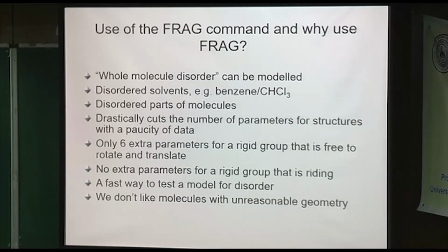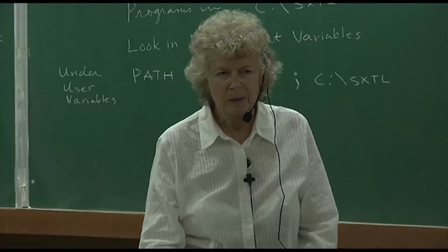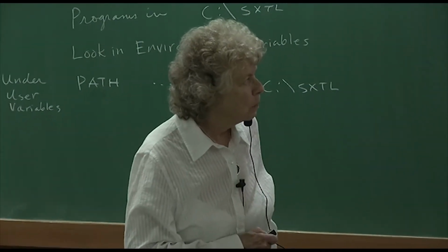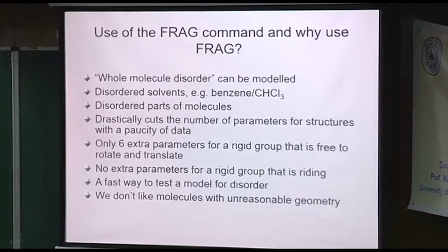Okay, now I'm going to talk about FRAG. This is pretty advanced stuff, and bear with me because it's extremely powerful. And maybe the first time you try this, you won't get it right, but you can always ask me, and I can help you. One of the ways you use it is this whole molecule disorder idea.